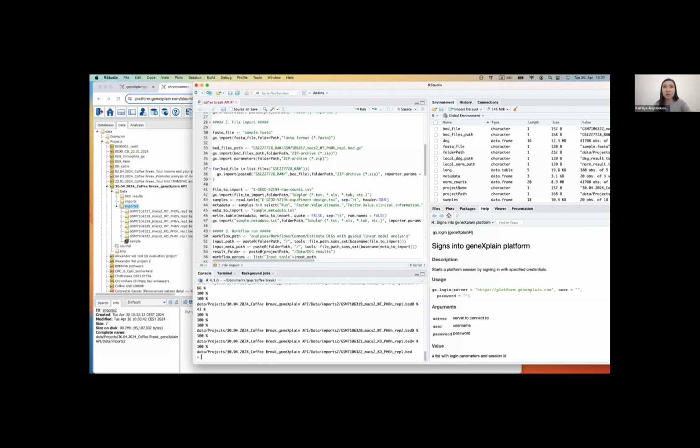If you don't want to download manually, I think there are some download options available for SRR to automate this step, so you first get the files onto your system in a more programmatic way, and then into the platform.